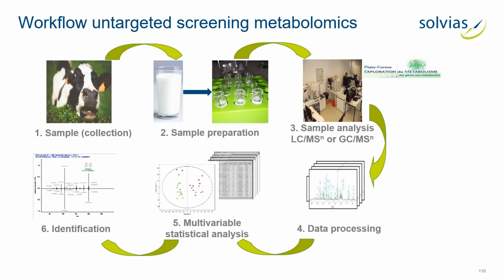After that we have a processing of the data, which is a little bit more complicated, but as you will see later, the metabolomics field has defined some methods for how we can analyze this data very simply. Afterwards you have a principal component analysis, which usually gives you wonderful pictures, because the aim of a metabolomic study is very often to see the difference between two groups. We have one control group and one treated group, and you want to see what the difference is between them. So you have to find out which metabolites were really changed, and therefore we have the principal component analysis, which is also a very well established technique.